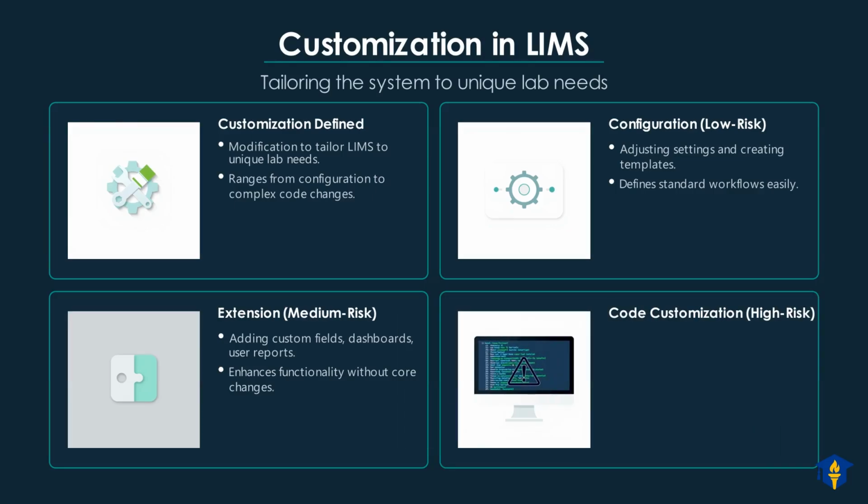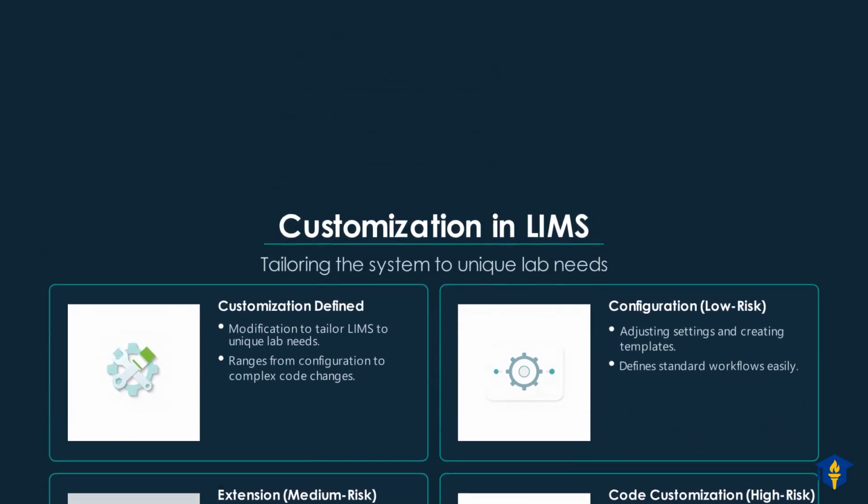Finally, code customization represents the highest risk level for your LIMS. This involves directly modifying the system's underlying code or changing its database structure. Such changes require extremely careful development, thorough testing, and robust validation processes.